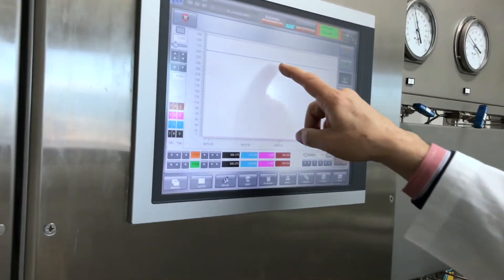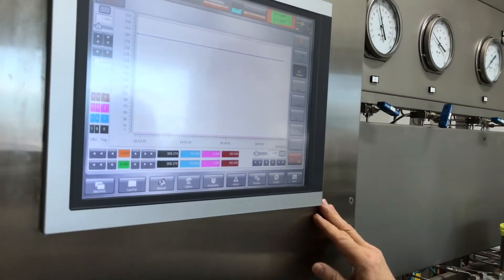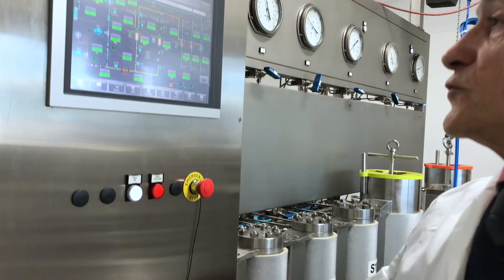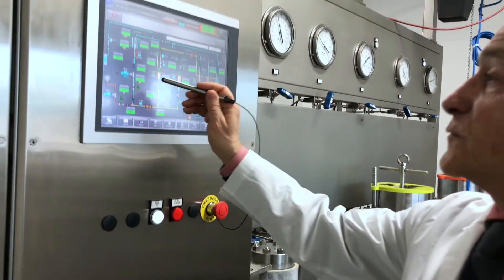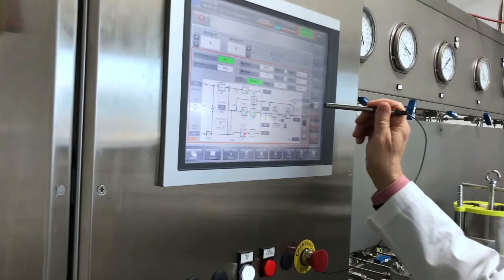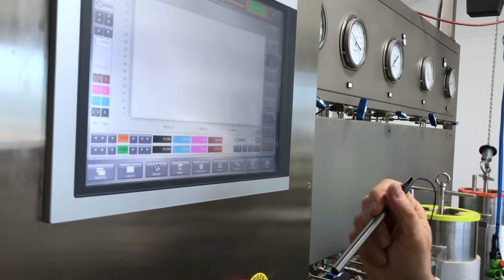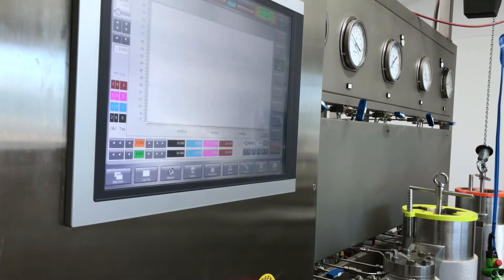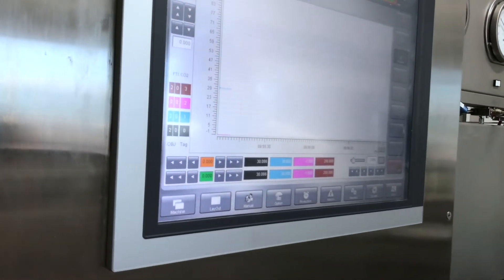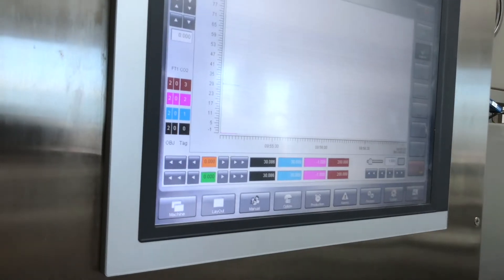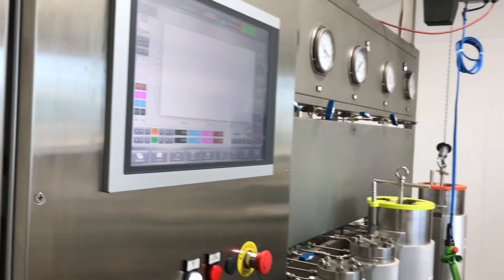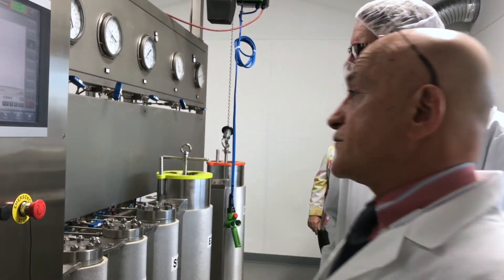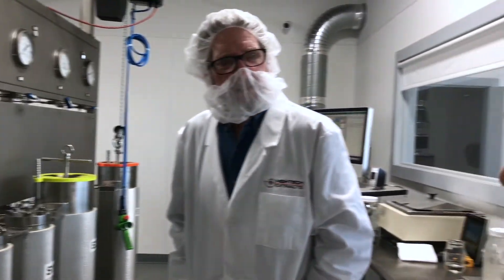The system is now running. You can see we're holding the pressure. Going back to the layout and looking at the pump, you can see how accurately we hold the flow rate. It's set up for about a four-hour cycle.